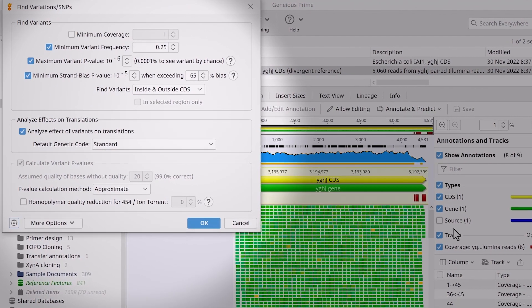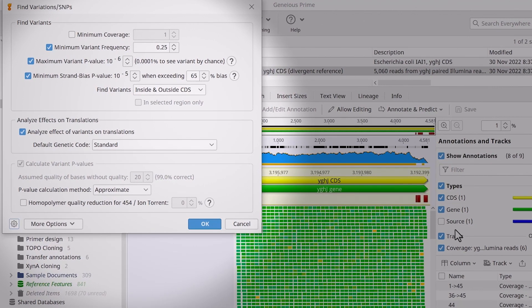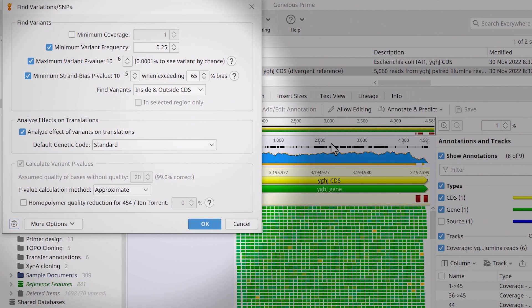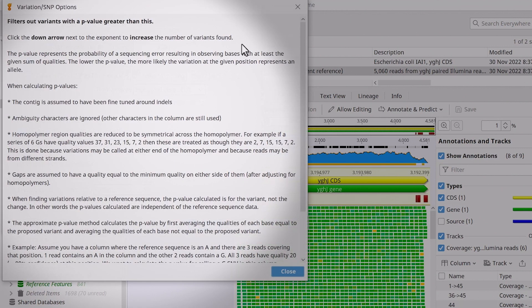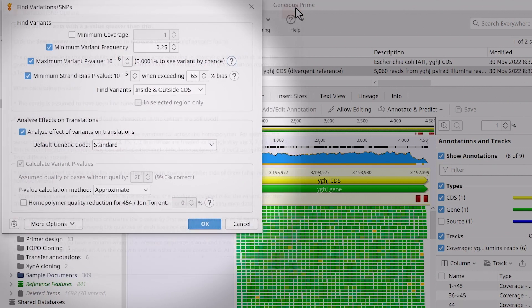The options in the Find Polymorphisms section allow you to set the parameters for calling SNPs. These ensure disagreements that result from sequencing errors are filtered out. To learn more, select the Help buttons. I will leave these as default.